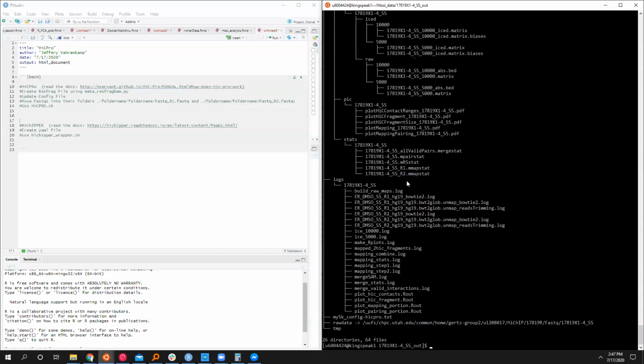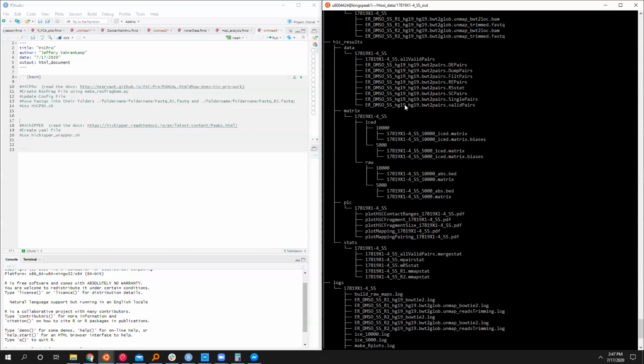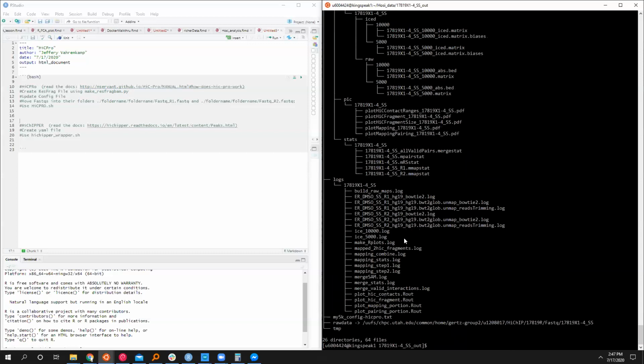And I swear there was one other one, but that might be HiC-Pro that puts it out. Oh, these iced files are useful. Like I said, it's been a while since I've looked at this, so I apologize if this is very confusing.